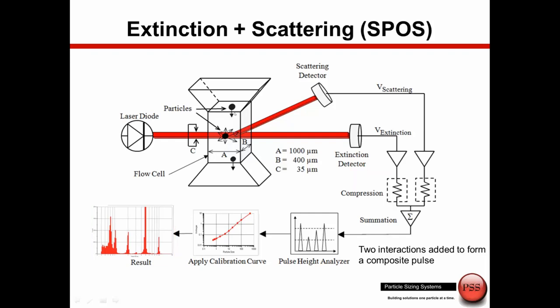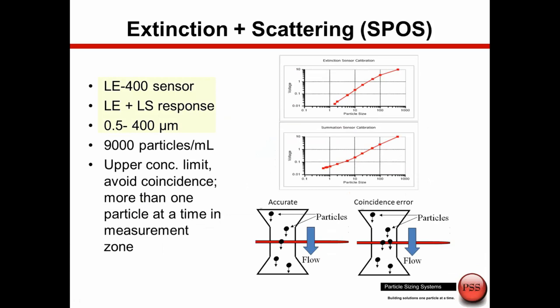This is the LE400 sensor, which has a range of 0.5 to 400 microns. When we use both extinction and scattering it has a dynamic range of 0.5 to 400, and there is an upper concentration limit on the scale of around 9,000 particles per ml. This limit exists because we can only have one particle at a time passing through the sensing zone. If two particles pass simultaneously, we count and size them as one larger particle — a coincidence error. This is why we need to be aware of sample concentration and may need to dilute to avoid these errors.